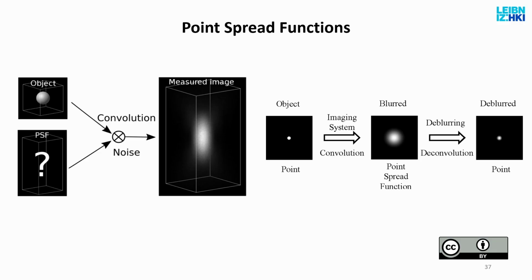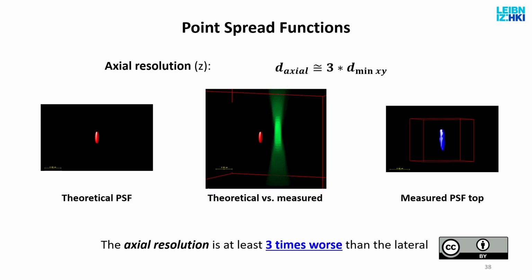This process is called deconvolution, and this is the first step of image analysis, where you either do the experiment yourself or you ask the experimenters to do it to measure the point spread function. We will talk about this after break, and using software which you can have access to. Right now, JIPipe is being worked on to have this option to calculate back the actual shape and size of the object, taking into account what the microscope does to the object.